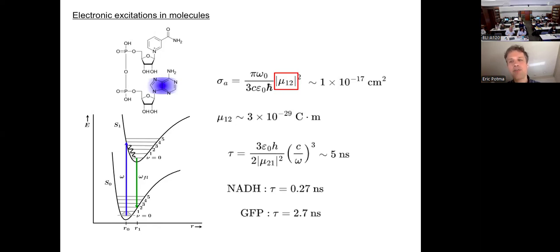So if you see a lifetime that is much shorter than a nanosecond, that means that there's a very strong non-radiative channel. That means that molecules in the surrounding bump into this chromophore all the time and they extract energy from it. Got it. Now, this GFP, 2.7, which is only half of this, means this is a very good fluorophore, because it doesn't lose energy through non-radiative channels.